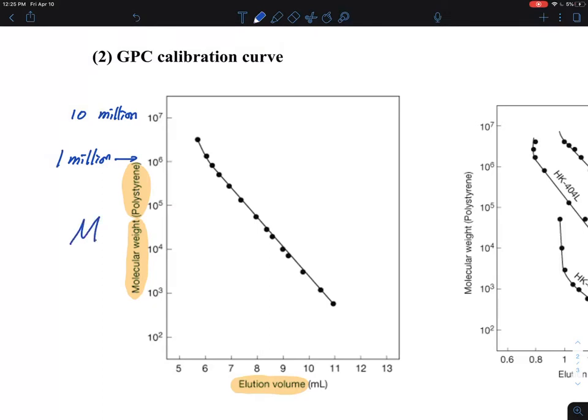So this is a molecular weight log scale. And you can see that they were able to make some polymers, probably a few million. And then it comes down to about this lower molecular ranges. That's about, I would say, this is about 1,000, right? So 1,000 gram per mole.